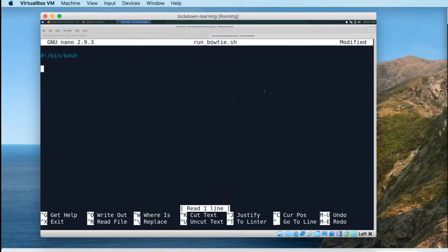It will require a restart of your virtual machine to make that take effect, which I haven't yet had a chance to do. So I'm not actually sure at the moment whether this sharing is working, because I haven't had a chance to reboot my VM to test it out. But in theory, after your VM's had a reboot, you should then be able to copy things on your host machine and paste them into your VM.